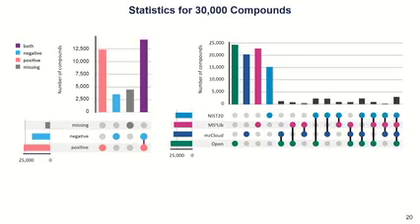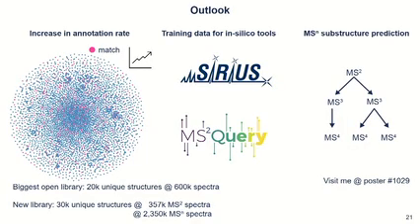And then this statistic here is about how many unique compounds we have in each database. We see the biggest one here, which is open, and with open I mean MassBank North America, MassBank EU, and GNPS. We get almost 25,000 unique compounds that are not included in any other database. And if we look here at the MSn library, we are almost reaching the same level just in our 23 days, just acquiring data in one lab. This is definitely something we need to extend again, and I think this shows you what we can actually reach as a community.